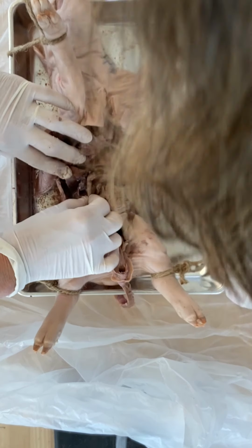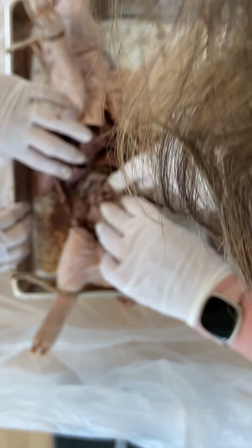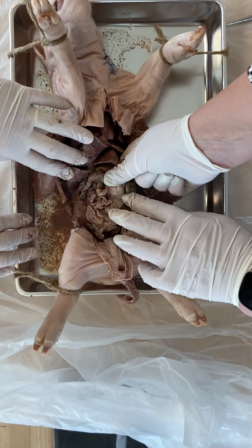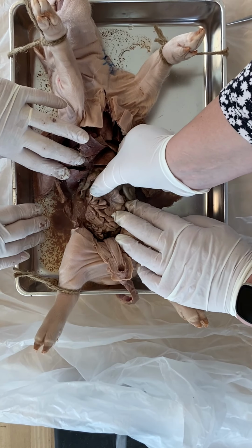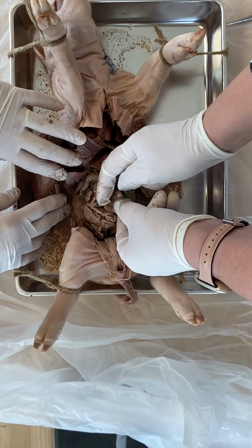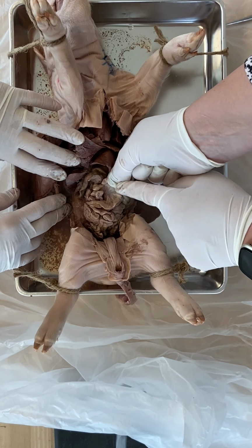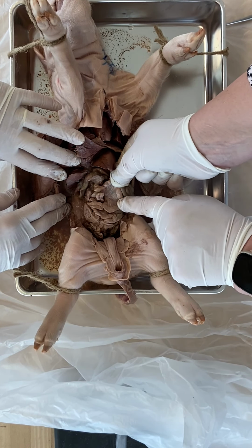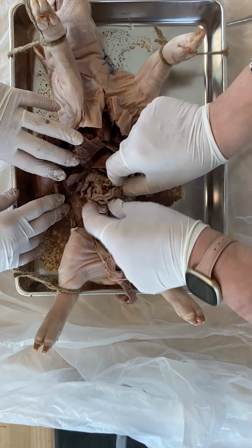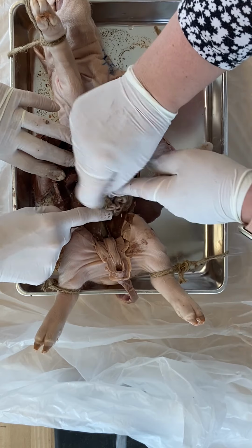What I think we can show better on the preserved than on the fresh one is the membrane. Although we could see it yesterday, it's the membrane that holds the small intestines in formation. So this is not loose, it's not like a hose pipe that's all piled up. It's held in formation by these membranes, on a ray out here, and you can see the blood vessels going in and out quite nicely. So all of this is small intestine.